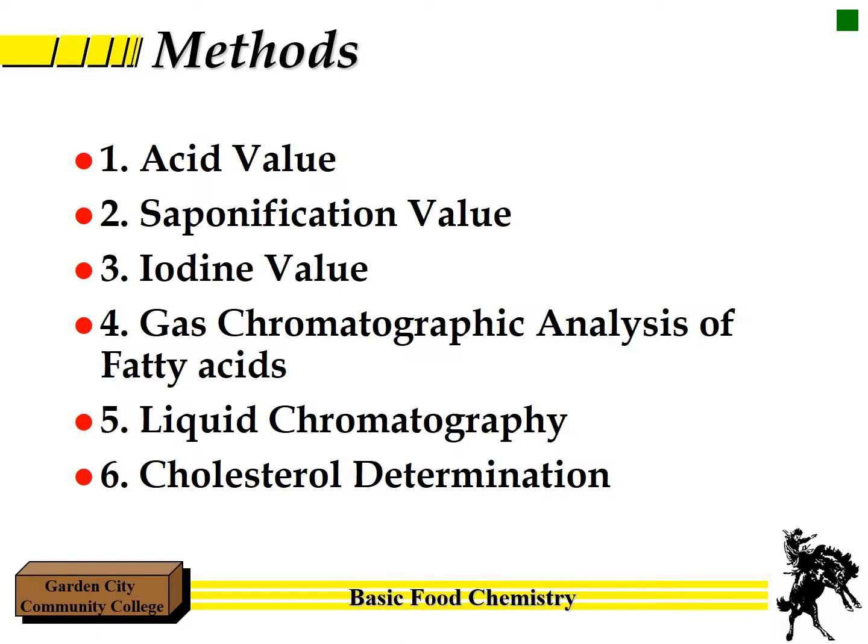So, here are some methods that are out there. You can do some acid value, some saponification value, some iodine value, some gas chromatographic analysis of the fatty acids. You can do liquid chromatography and also cholesterol determination.